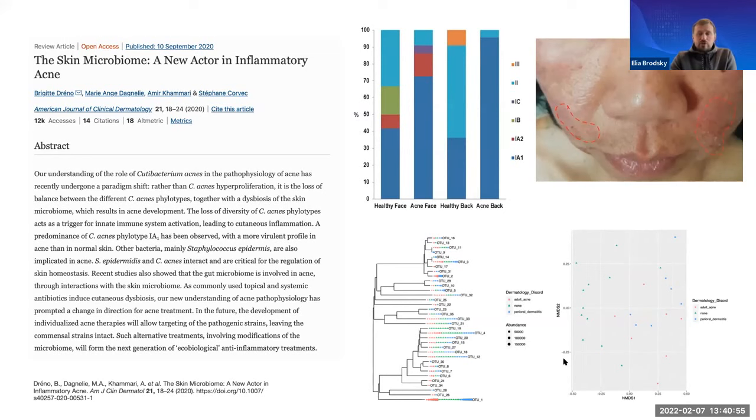So one of the questions could be, how do these microbes essentially interact with the skin itself in inflammatory acne, right? So how do they cause inflammation? And so here in this discussion, we can also download the data, and we'll look today at where this data could be found and try to understand what some of the differences are.